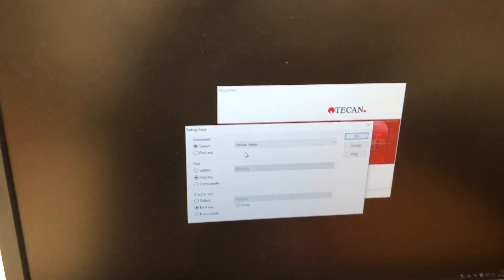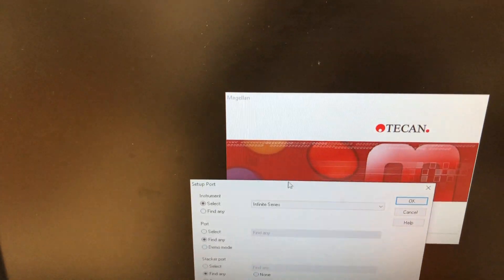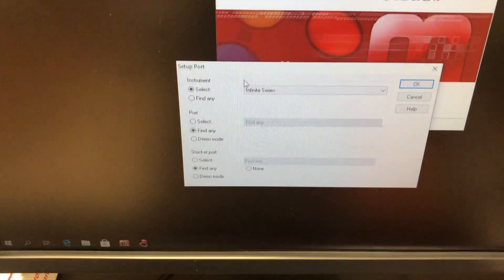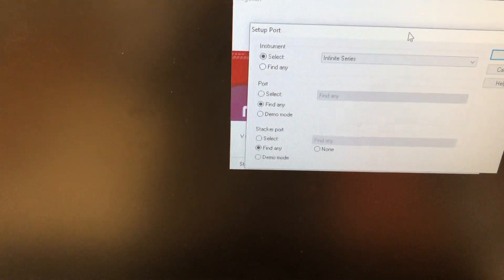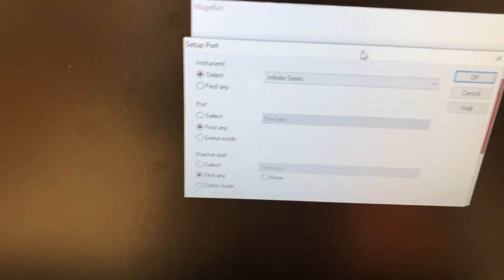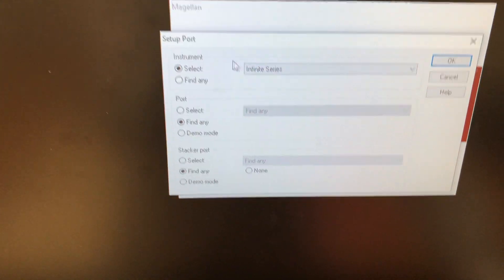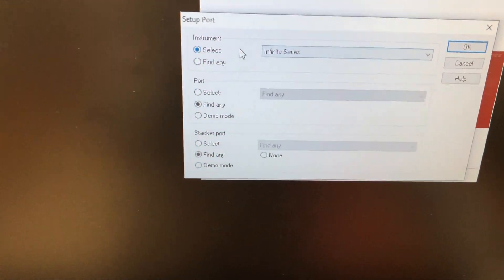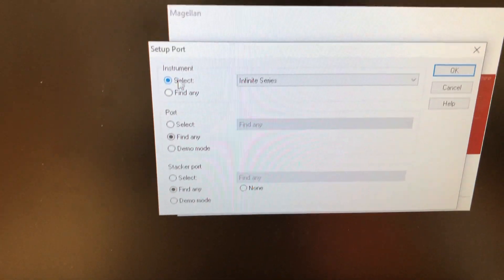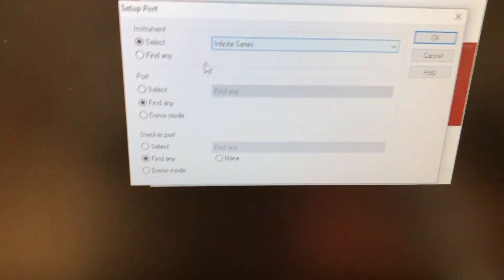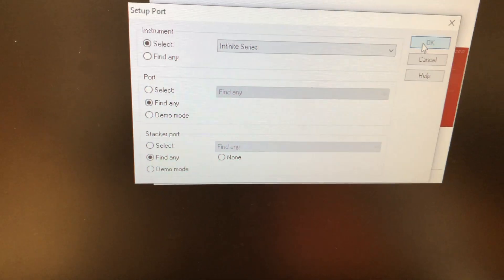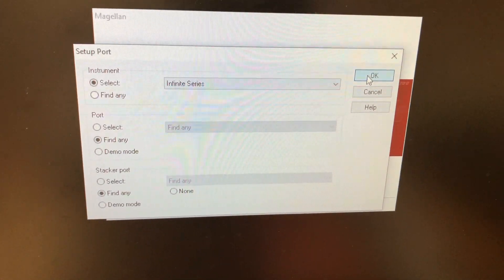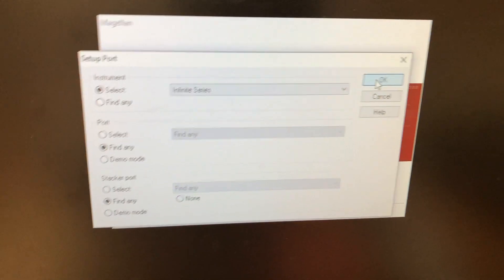This particular instrument can use this Magellan software. We also have an iControl software that works in the event that occasionally this Magellan software gives us issues. In which case, the i-control software will work. Sometimes this instrument has to make us find the port. As we can see, it's already set to select the infinite series and then find any stacker and port options. Those usually find the instrument as long as it's on. You just want to make sure it's on before you open the software.